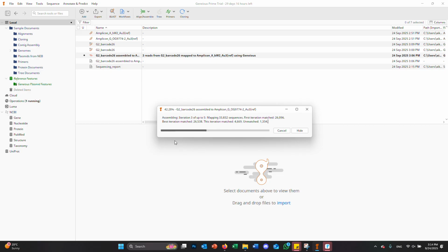You've got some from Brazil. So we've got our AU strains, and I think the MF1 strain is a Brazilian isolate. I think the others are from South America too, which is the host region where myrtle rust originated. Then you can see the alignment, there are some similarities and differences across that amplicon.